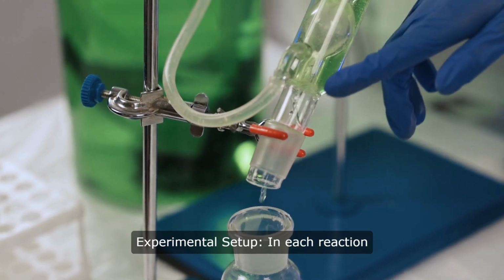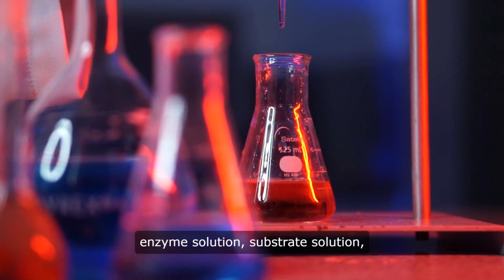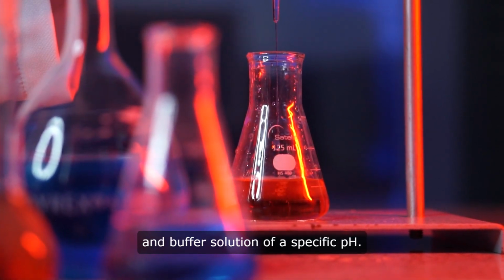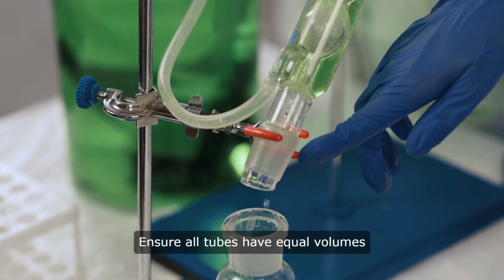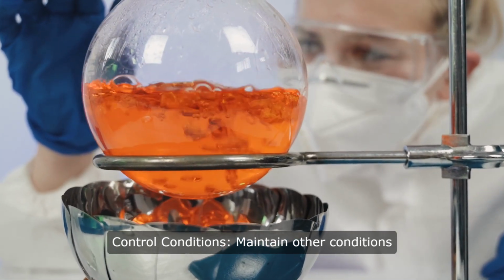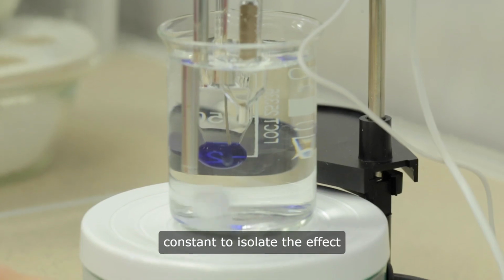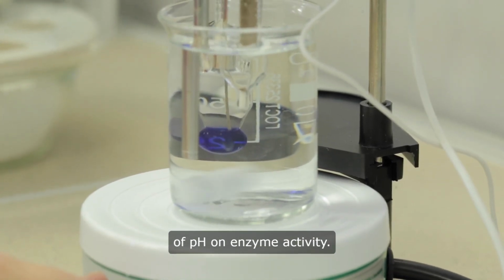Experimental setup. In each reaction tube, mix a fixed amount of enzyme solution, substrate solution, and buffer solution of a specific pH. Ensure all tubes have equal volumes to keep the experiment consistent. Control conditions. Maintain other conditions like temperature and enzyme concentration constant to isolate the effect of pH on enzyme activity.